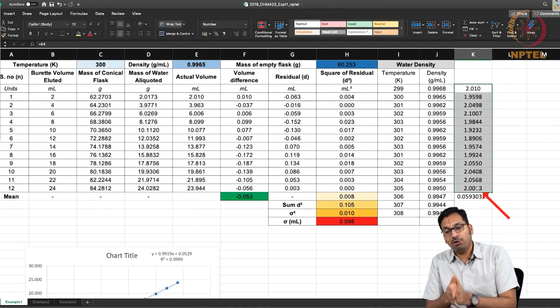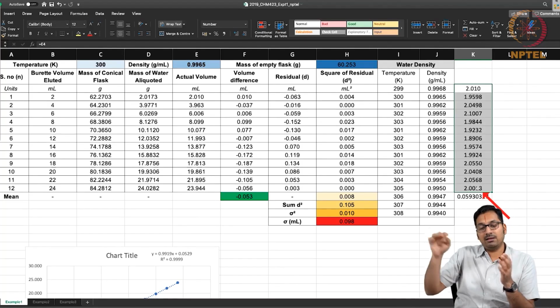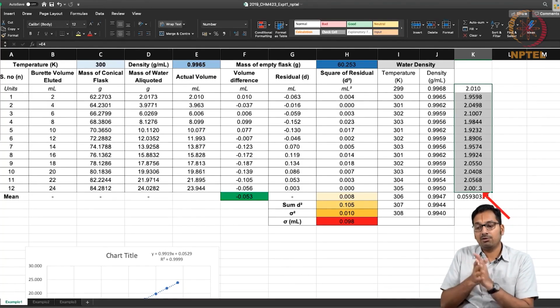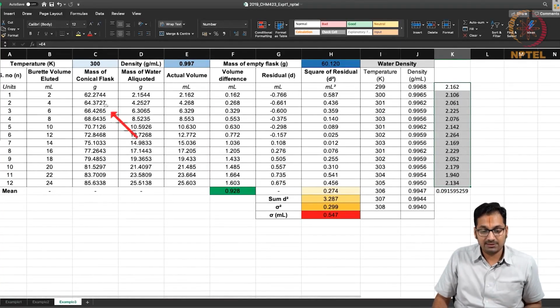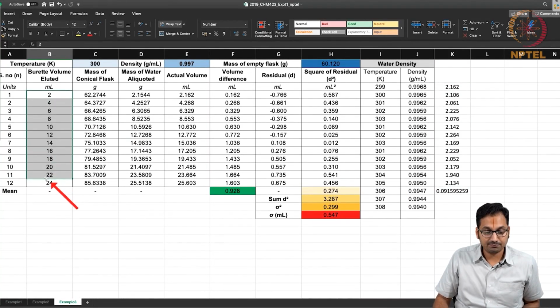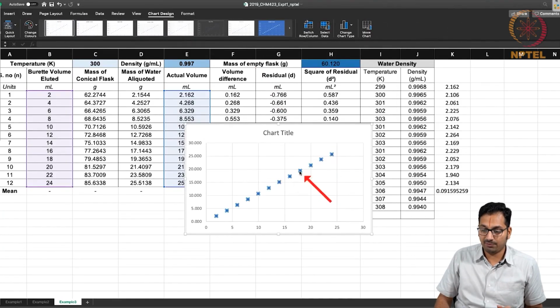So I hope this has given you an example of how to use software, and in this week you would be given data to analyze using simple spreadsheet software. To start with, this is an example where a linear regression is fitted to understand how the data can be analyzed. And to finish up, in the same way we did a linear fit for the first one, you can do it for this one as well, just to see how far the measurement deviates from the average value.